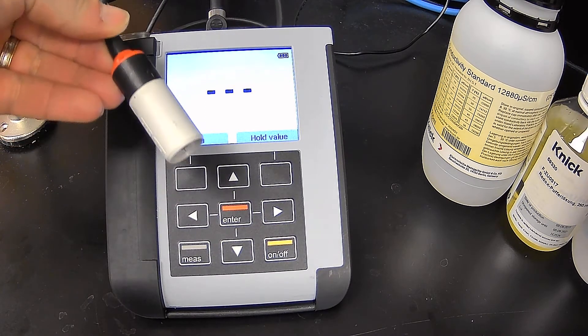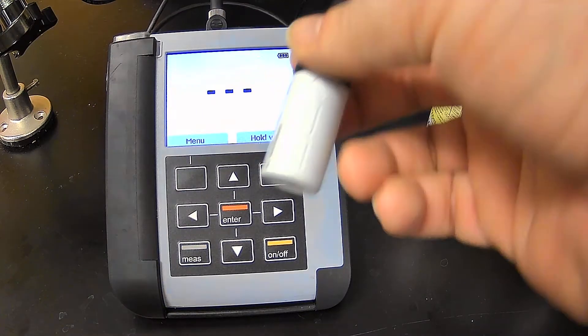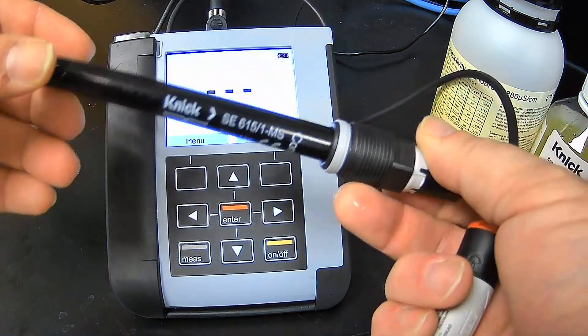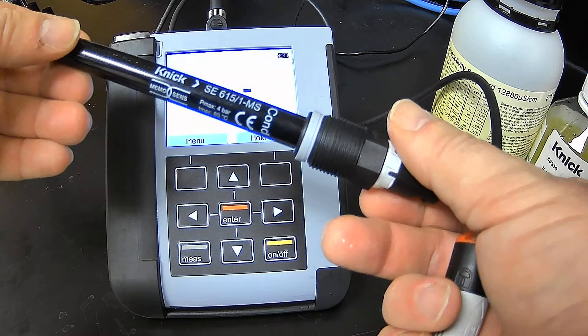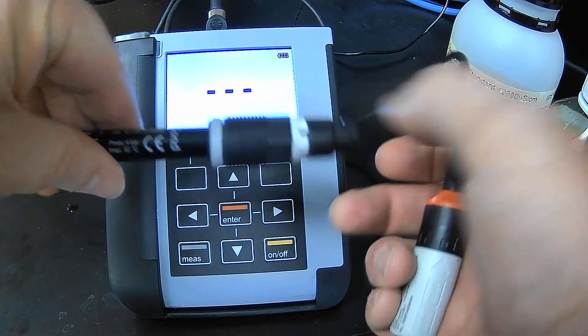This is the cable that's plugged into it currently. And then what we're going to calibrate is this electrode right here, which is a memo sense conductivity electrode with a PG 13.5 thread.